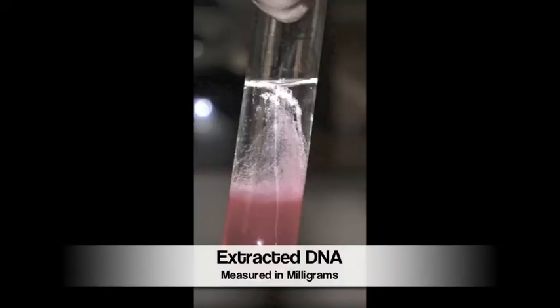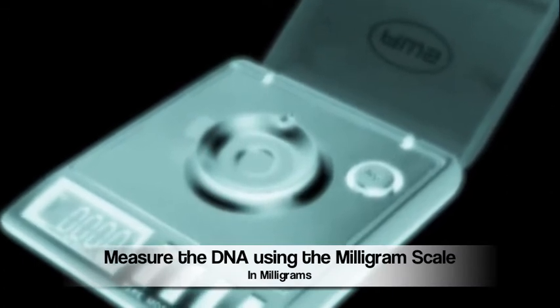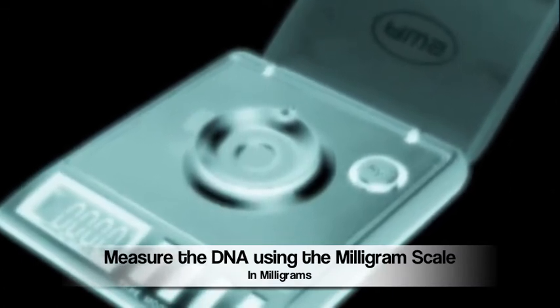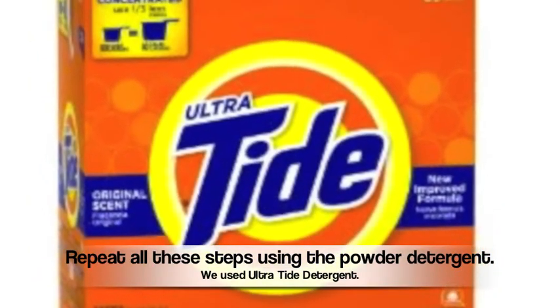Remove the DNA with a skewer stick. Weigh the DNA by placing the skewer stick onto the milligram scale. Make sure you weigh the skewer first, then subtract the weight of the stick from your total weight. The amount of weight you have left is the weight of DNA. Finally, you repeat all the steps with powder detergent.